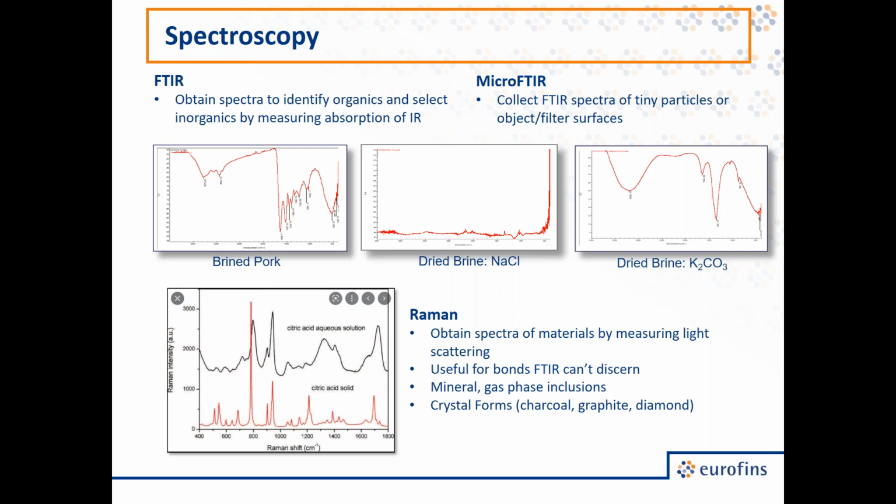You say, well, it's the same thing. Why should it look different? But it's not actually the same thing. In the crystal, in the solid material, citric acid is interacting only with itself. And so there is one set of bonds within the molecule and between molecules. But in solution, the citric acid is mostly surrounded by water molecules. So now we have different types of interactions as well as the structure of the citric acid, and we can see the results of both of those types of interactions.